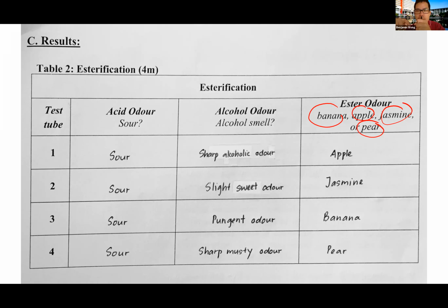When you smell directly, you overwhelm your nose, then whatever you smell later on may have interference. So in order to avoid that and also to protect your nose, do not smell directly like that. In the lab, if you are asked to smell anything, do not smell directly, in case it damages your nose nerve.